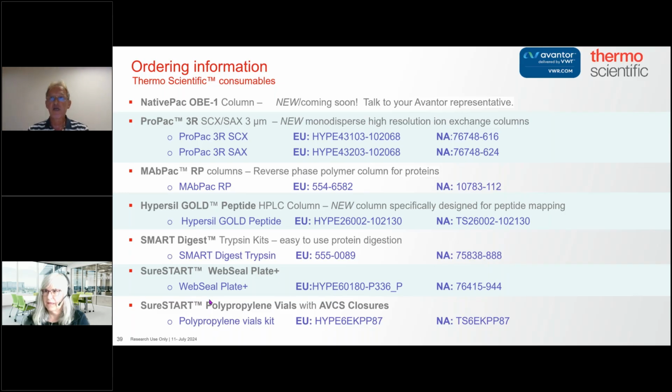The deamidation levels are very, very low, and it's the same for oxidation. We see very little oxidation due to the digest itself. So I thank you for that question because it's one that would come to mind. High temperature means more deamidation, but we've reduced the pH so you don't get that.